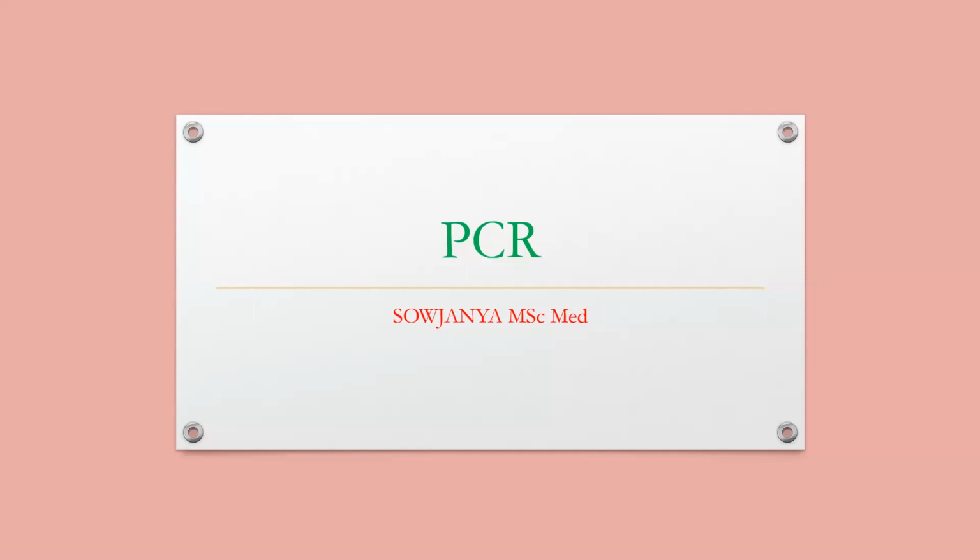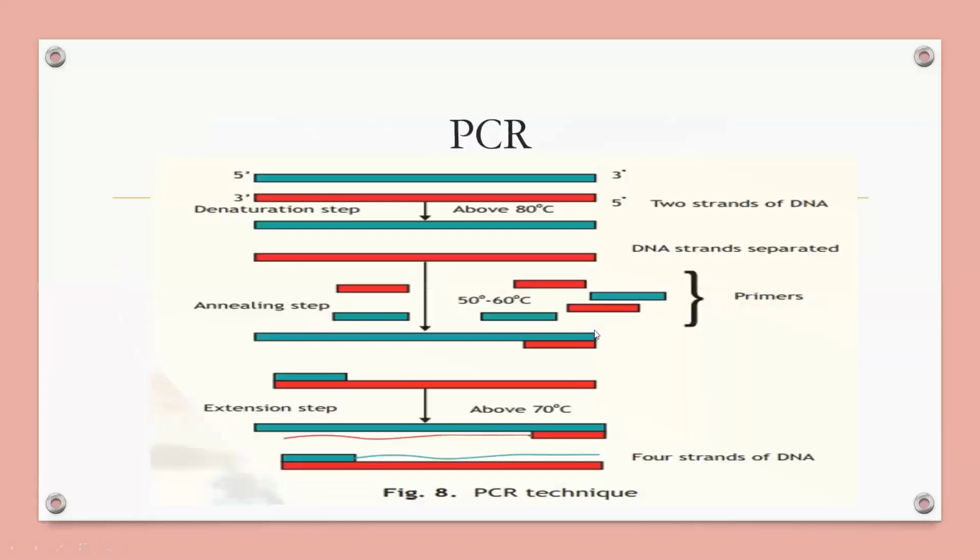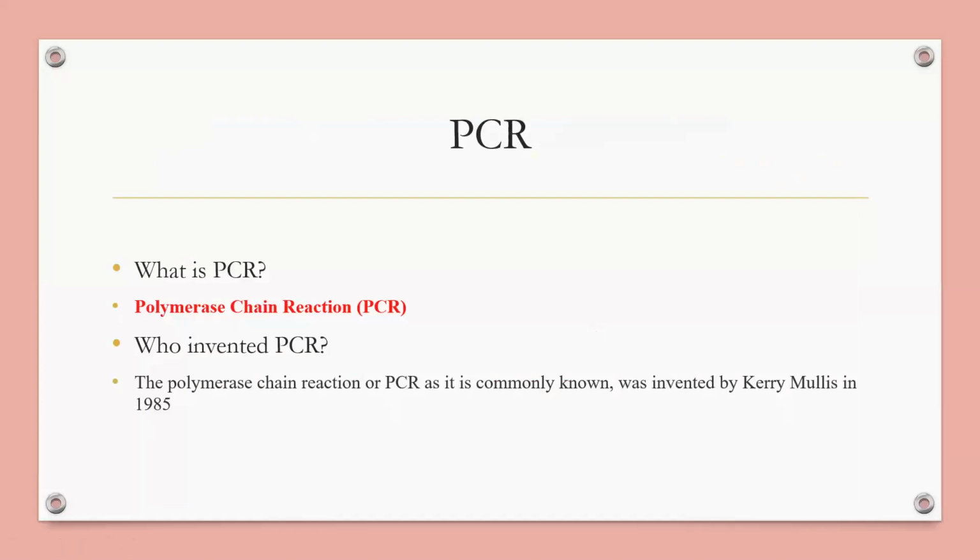Today we are learning an interesting topic: PCR. PCR means polymerase chain reaction. This is a very important technique. P means polymerase, C means chain, R means reaction. Polymerase chain reaction.